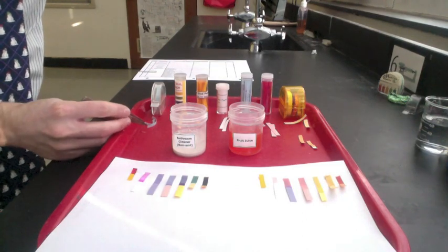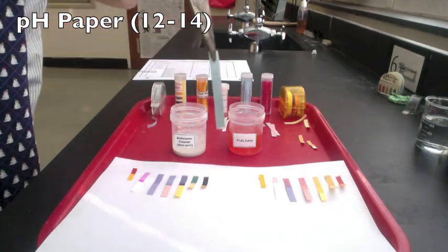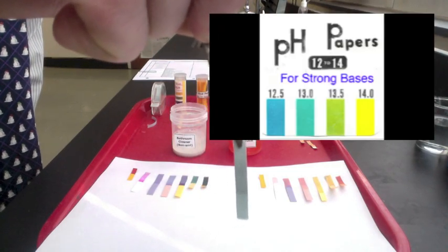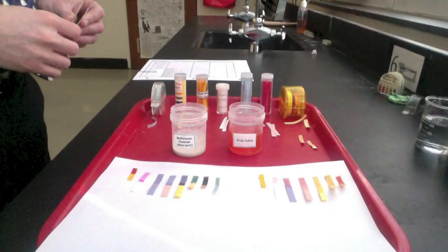We can also use pH paper made for really strong bases, with a pH between 12 and 14. The bathroom cleaner shows up as a blue, which according to the chart would indicate a pH of around 12.5. Based on all our testing, we can see that the bathroom cleaner is a strong base with a pH around 12, and the fruit juice is a weak acid with a pH around 5.